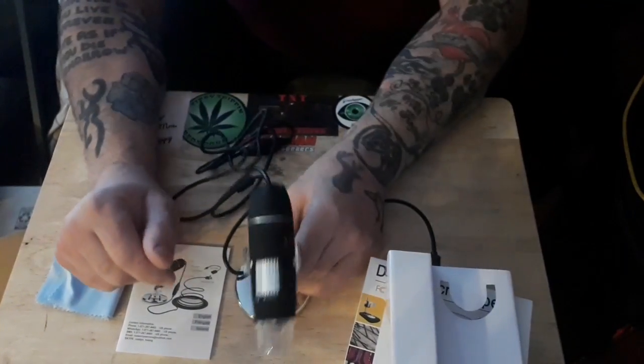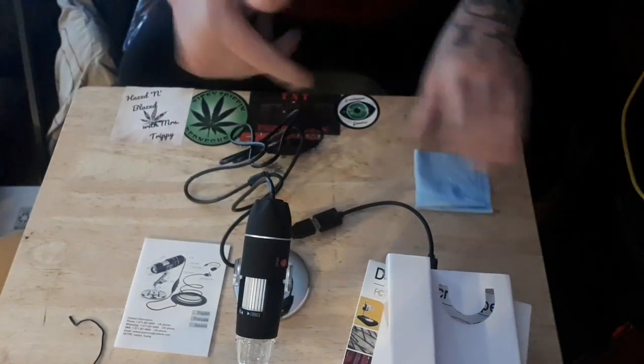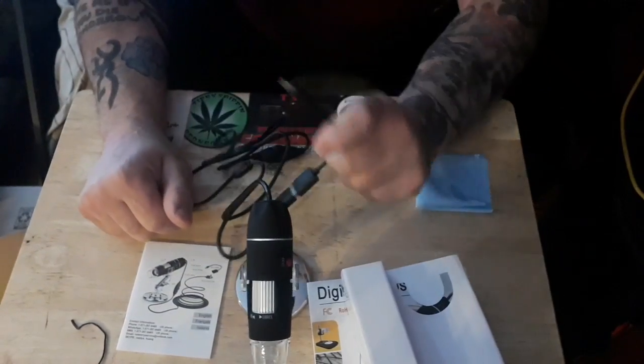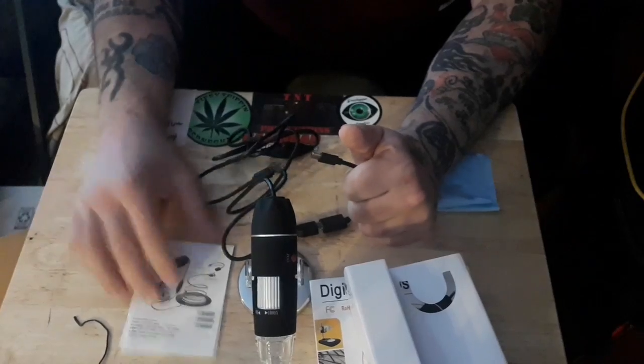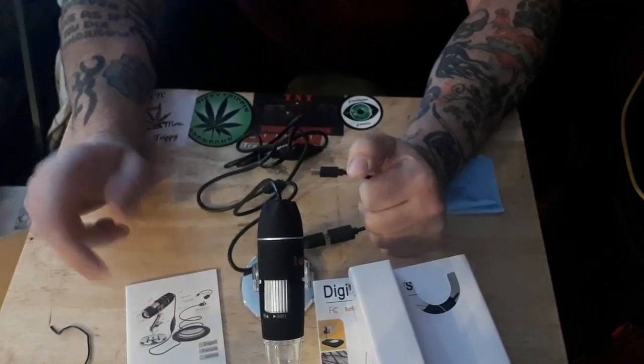Apple is a joke — they wanted their plugs to not be made by everyone else. I'd rather have stuff like this. We're going to see if it works with the cell phone. Here are the instructions, but you know us guys — we don't like instructions.